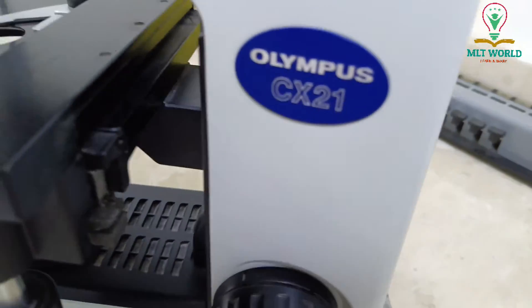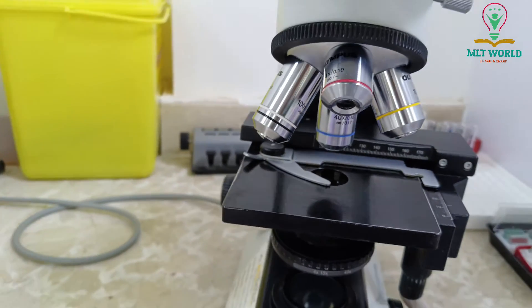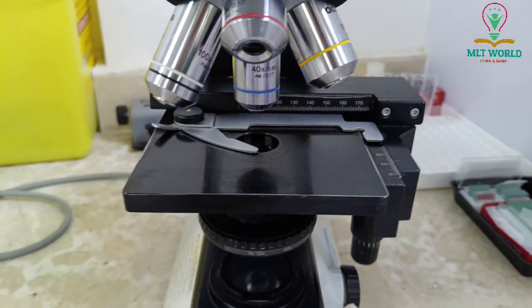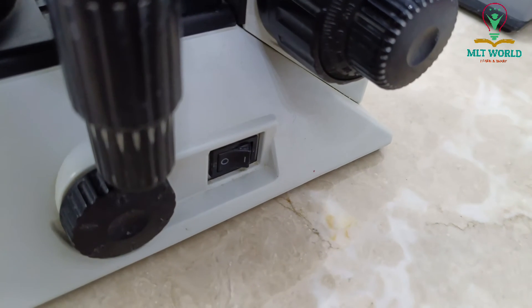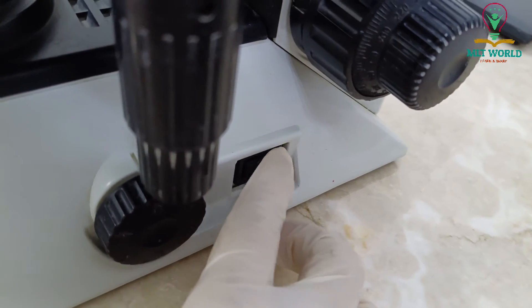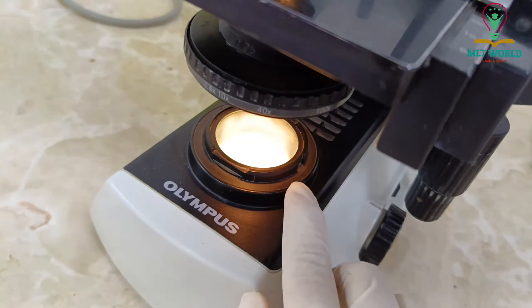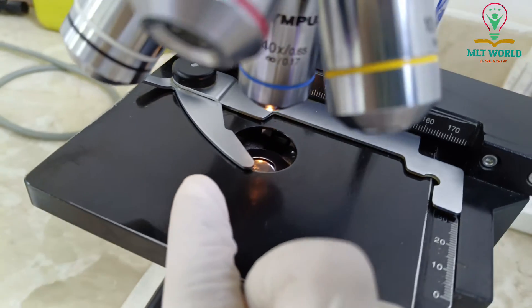This is the power button and this is the cable supply. This microscope is a light microscope because it uses a light source to do microscopy. From here we will press the power on button, and next to it is the light adjustment switch. You can see the light source that comes through and through the objective lens.